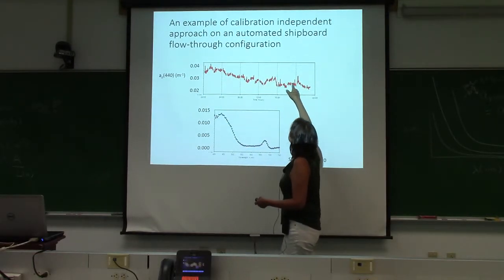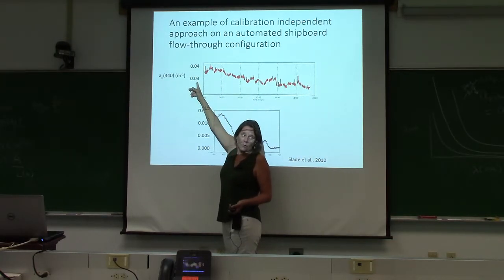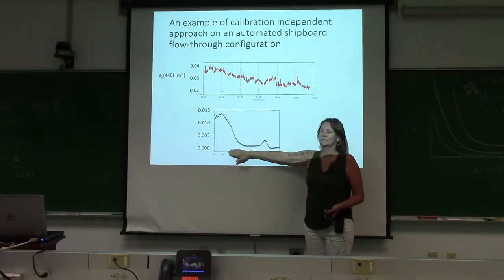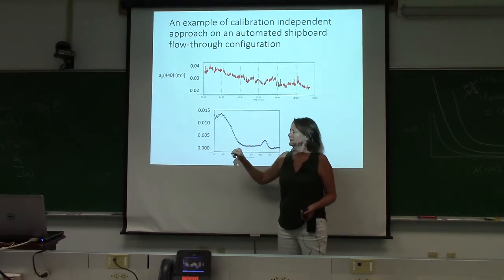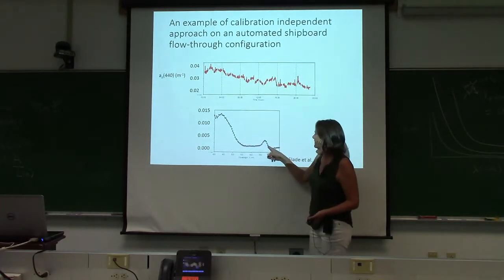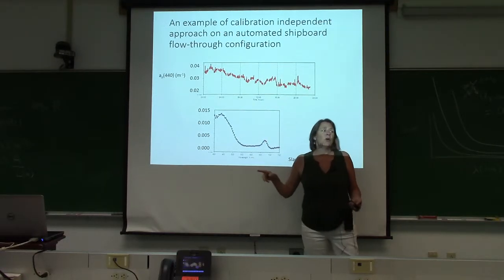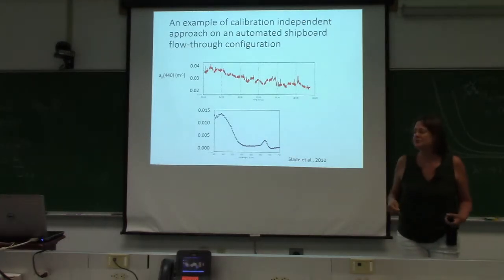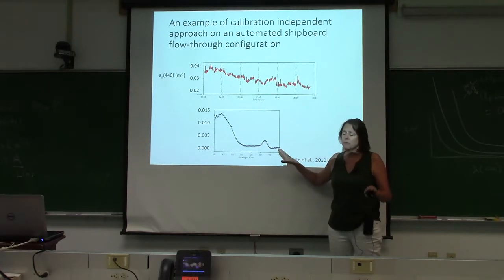Isn't this beautiful? This is absorption at 440. These are very clear waters. And when you look at the spectrum of the particles, you get this, 0.015. The red peak beautifully resolved at 0.003, 0.0025. That is almost the resolution of the instrument as reported by the factory. But you're resolving a peak here. It's incredibly beautiful, incredibly powerful.